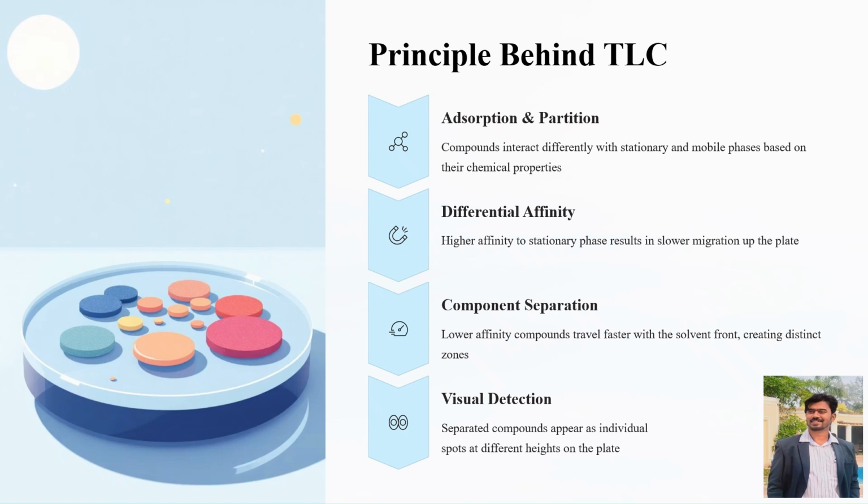And an adsorption example: if I draw a line on a paper, then what will happen? The ink will attach on the upper surface of the paper, whereas the opposite side of the paper is completely blank. So the ink is applied on the upper surface of the paper. Like, this is adsorption.